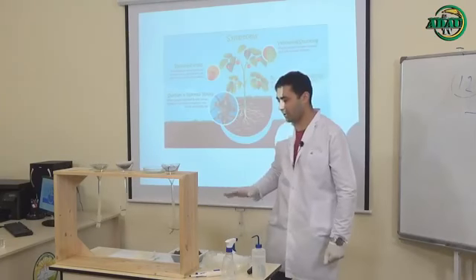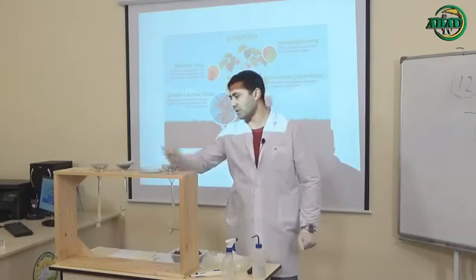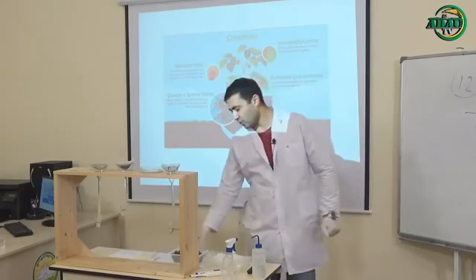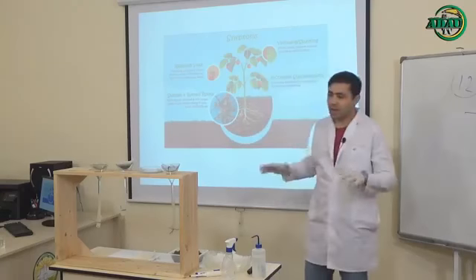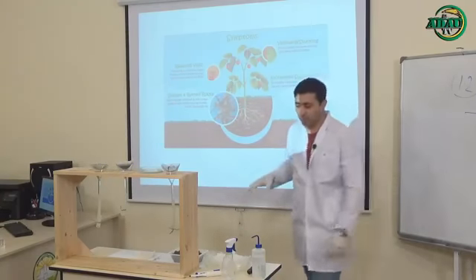It is not a big problem. First, you have to search for these equipments and take your soils. How we take samples from our field is also a main point.